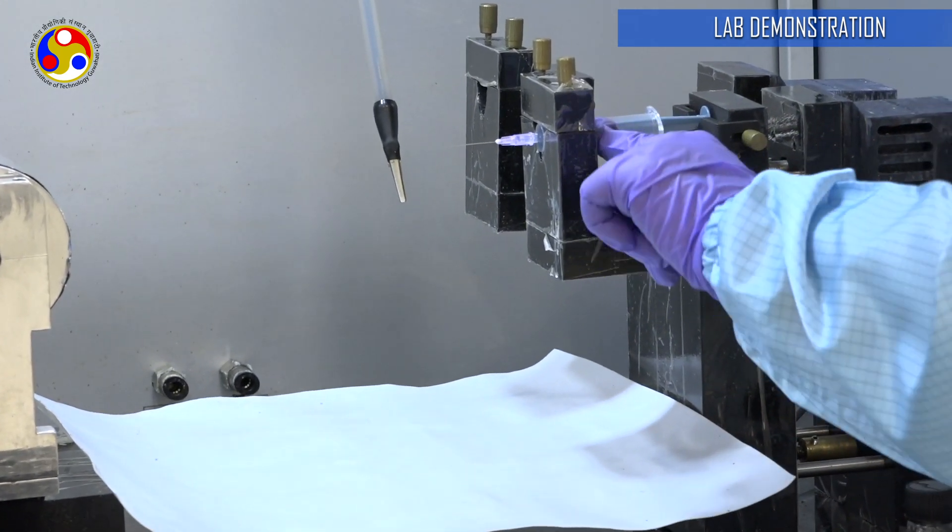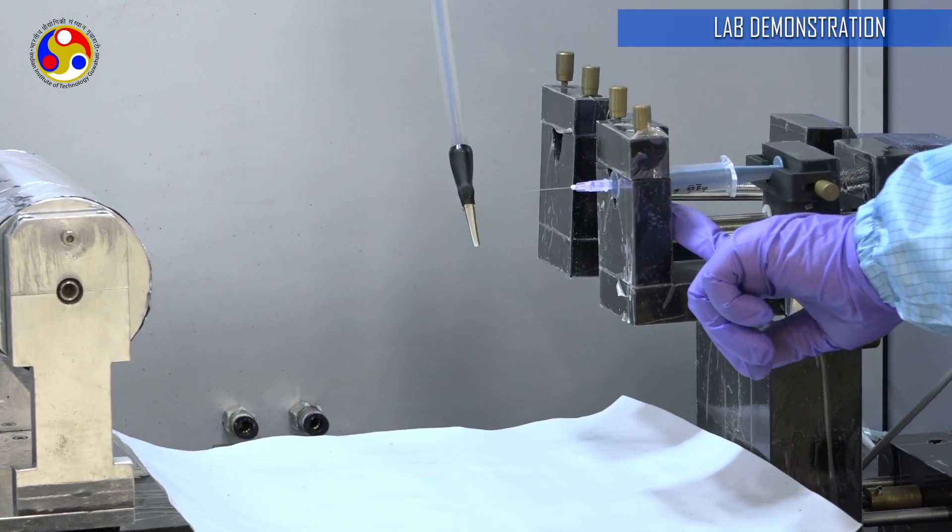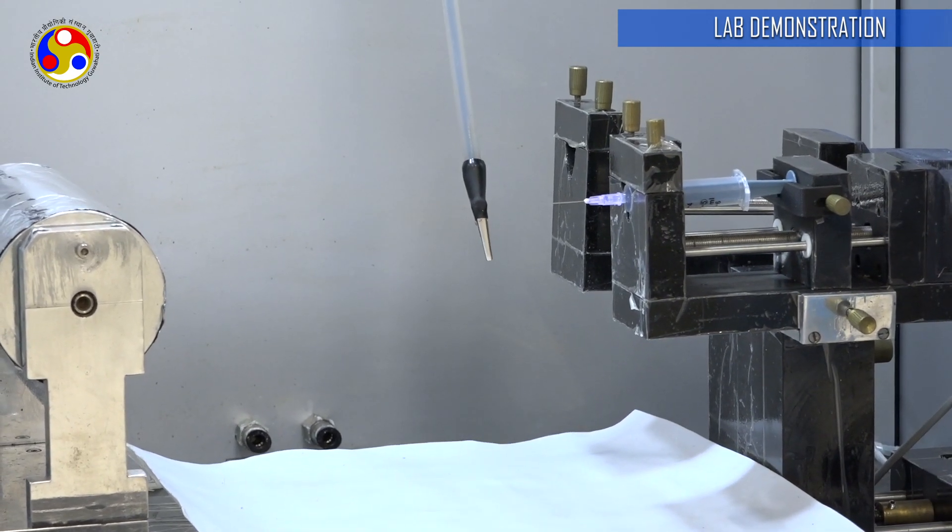I am going to push the piston again. This part will be affixed to this part over here. I am going to press forward again.